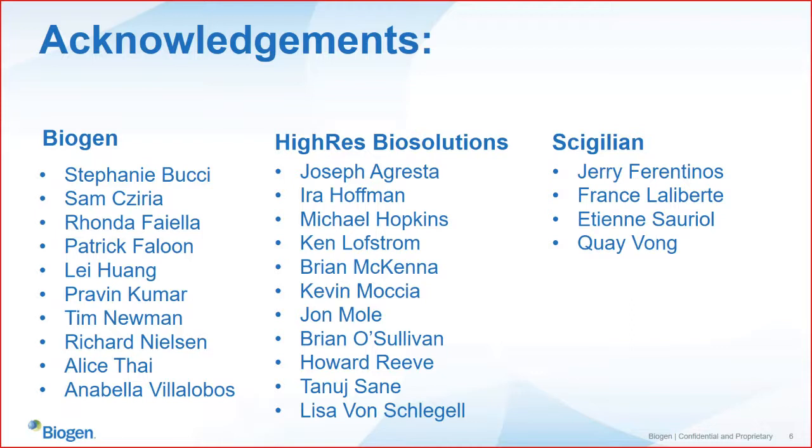Let's say that at the time that you submitted the sample, there was enough volume, but then you didn't run it for a day or two, and somebody came in and scooped up one of the samples you were planning on using. At the point of the sample manager pushing that through the system, it would notify you that that sample is no longer available, and then you would have the option to remove that sample at that point. You can always backfill samples by plating them on a new plate and then loading them into the system. So yeah, that does happen.